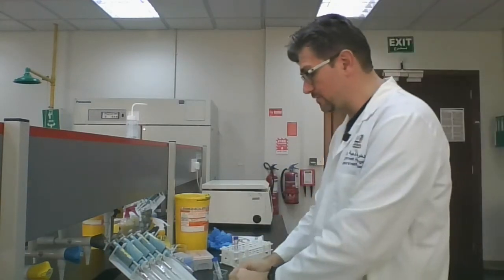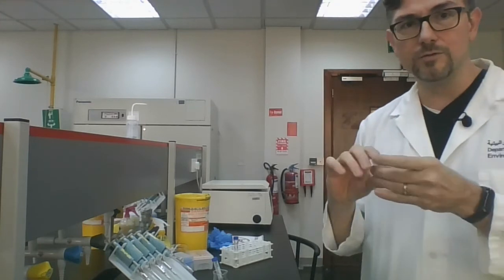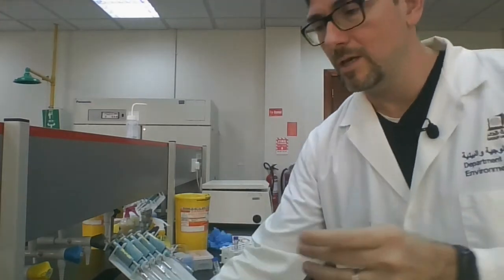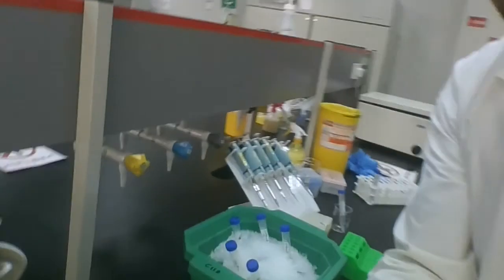So let's get started. First of all, we have your two epi tubes containing bacteria. Those are already pre-measured for you. You just have to put them into the centrifuge, so I'm going to do that right now. I'm going to place this in a centrifuge. Please make sure that you are balancing your tubes. You want to make sure that your tubes are distributed evenly between the two sides of the rotor.